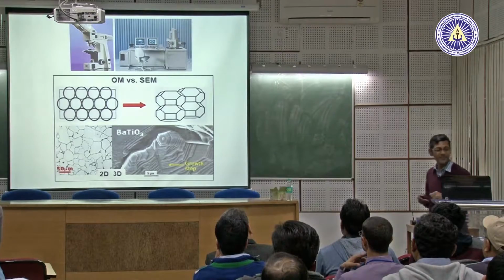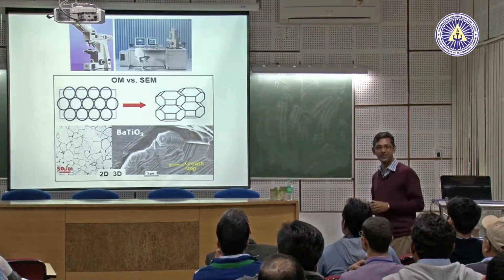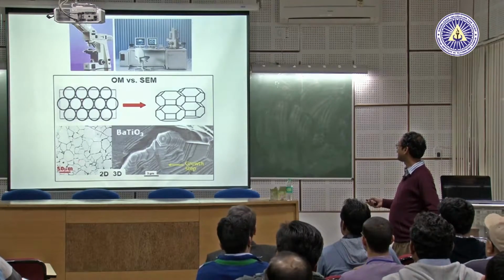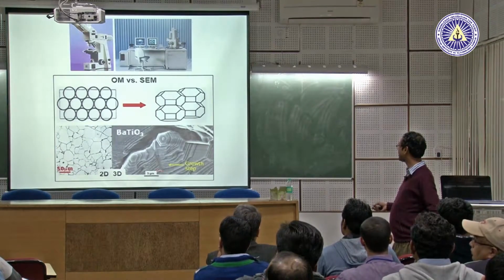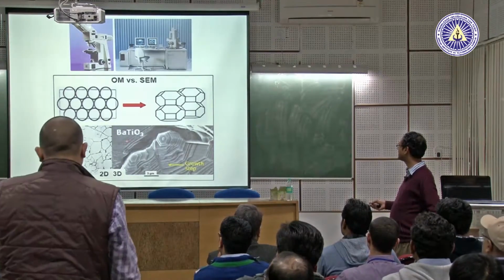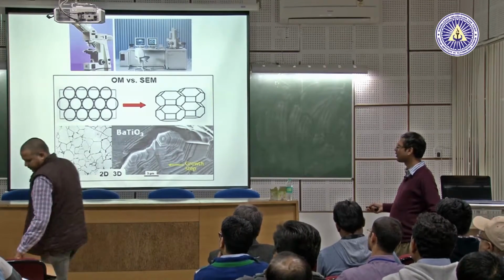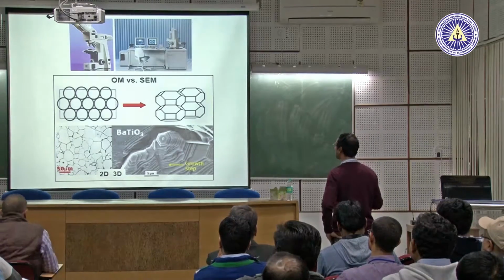Okay, forget it. Fine. Difference between, I told you depth of field, and I want to show you again and convince you. This is the optical micrograph, and this is the scanning electron micrograph of this titanate. You can even see the growth step of the crystals, which is not visible here, because of very high depth of field or depth of focus.